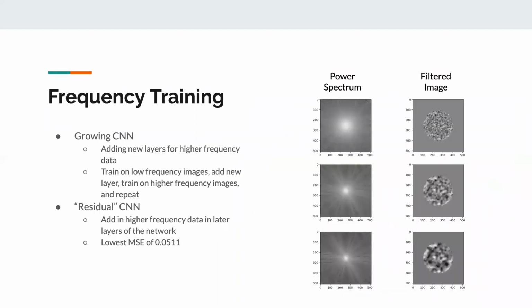For the regression model itself, we tried several different models. We had observed high overfitting in many of our models, which led us to believe that the neural networks were learning the high-frequency, extremely noisy information rather than the more reliable, lower-frequency information. Because of this, we created a new dataset that passed images through various low-pass filters. For each image, we had 3 filtered images, one containing only low-frequency components, another containing low and middle-frequency components, and the last containing all but the highest frequency components.